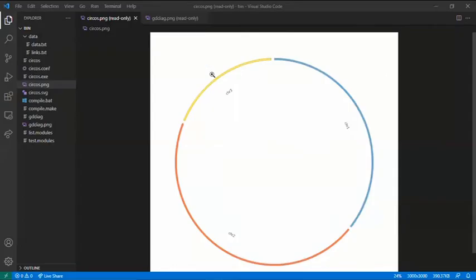Hi again. In this tutorial I will teach you the basic configuration for a Circos image.